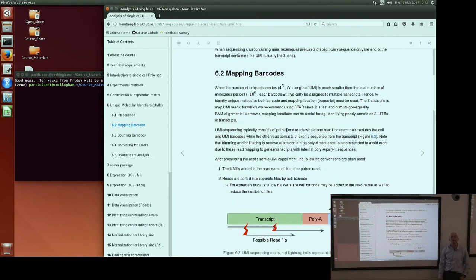Can only be done for transcripts which are known. Sorry? So when you put it in the barcode for the transcripts, it will be only for the annotated. Do you know how many roughly transcripts are there? So no, the barcode. You have these short barcodes which are randomly attached to the transcripts. And then always enough of them? No, there's not always enough of them.